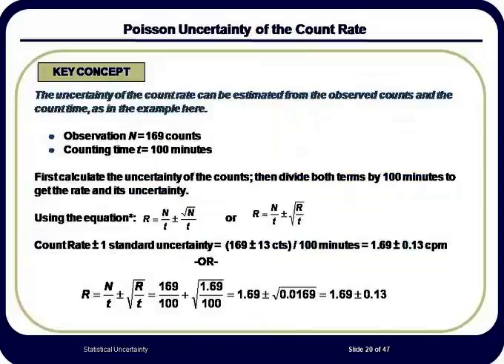If you think back to one of the very first lessons where we discussed what radioactivity was, you'll recall that radioactive decay, leading to counts, is spontaneous and random. You'll also recall that the longer the observation period is, the greater will be the number of decays that will be observed. As we saw in the previous slide, the uncertainty is estimated by the square root of the counts.